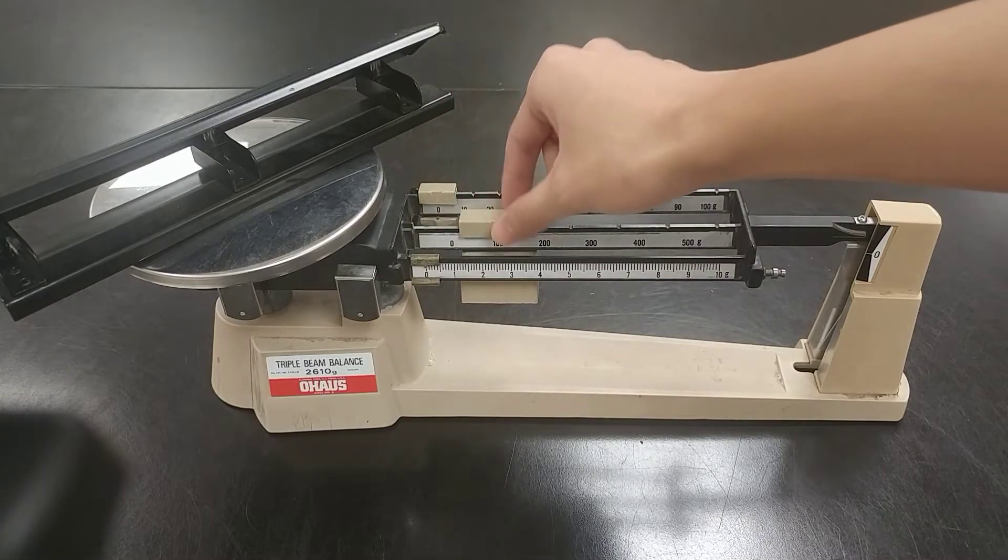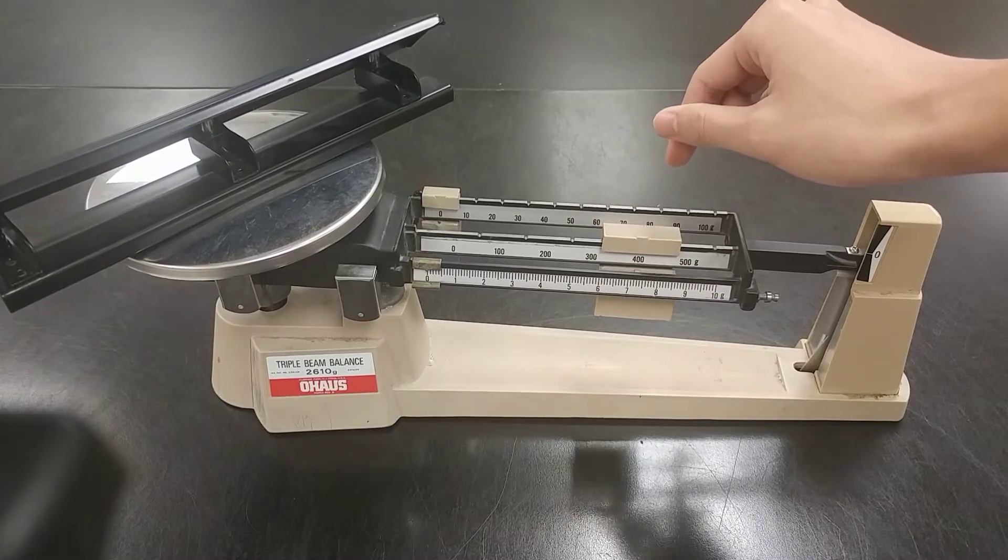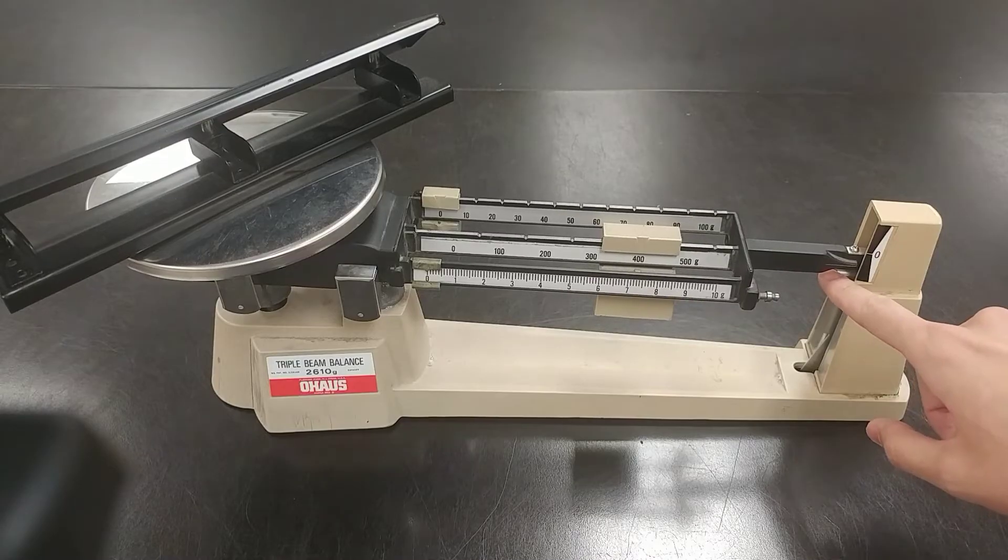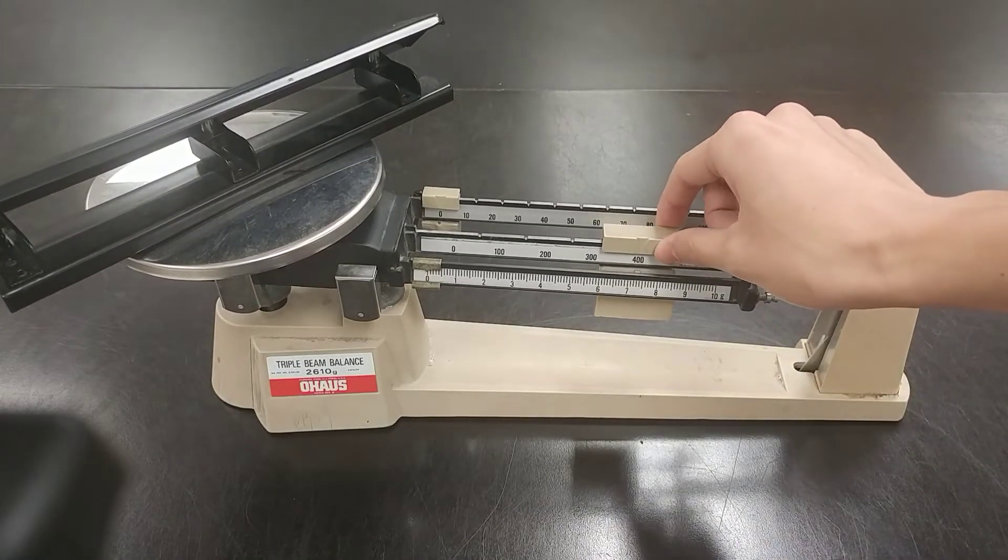Now we'll do the biggest one. 100, 200, 300, 400—okay. At 400, it goes down, which means it's too much because we want it to be exactly at zero. So we're going to go 100 back.